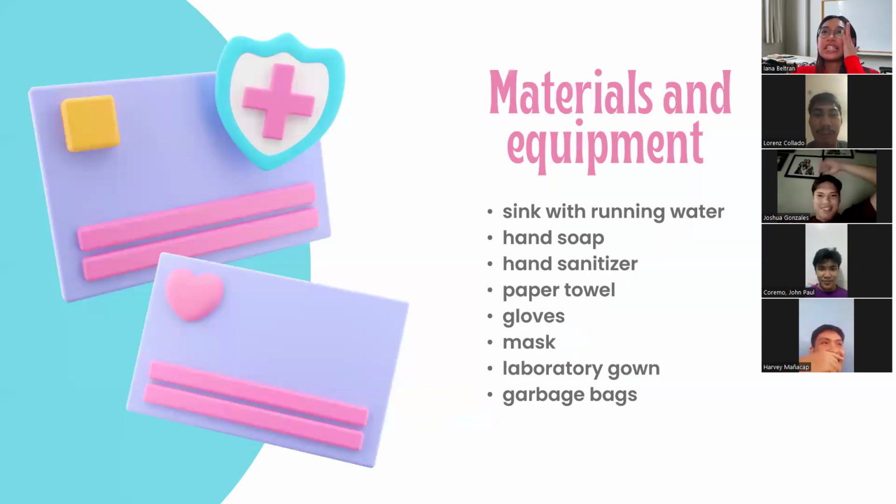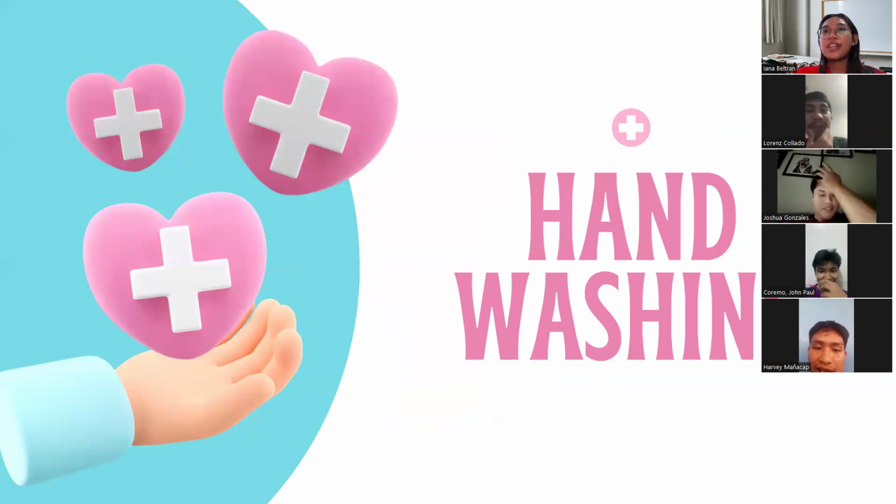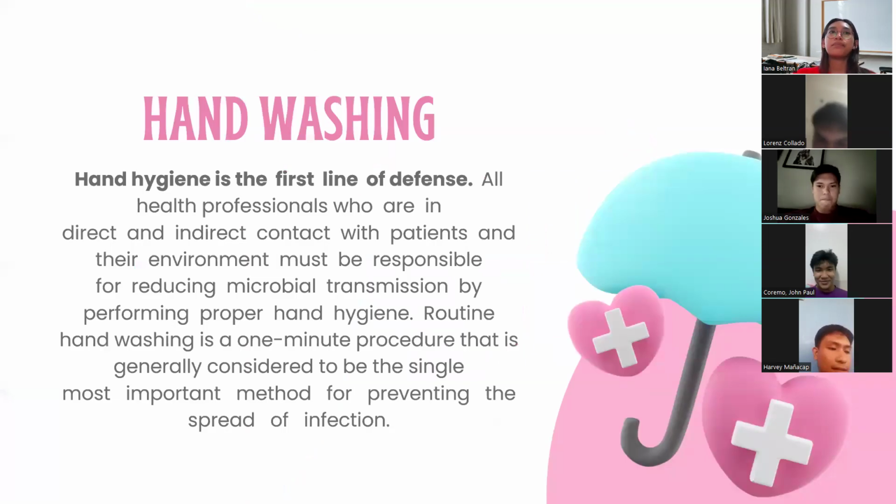Okay. So, materials and equipment. And then next, our hand washing. How do we wash our hands properly? So this is our source, from the World Health Organization and also our PMLS lab manual. So Mr. Collado, can you please read?